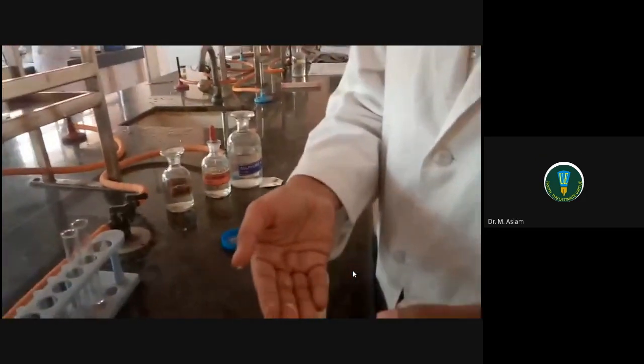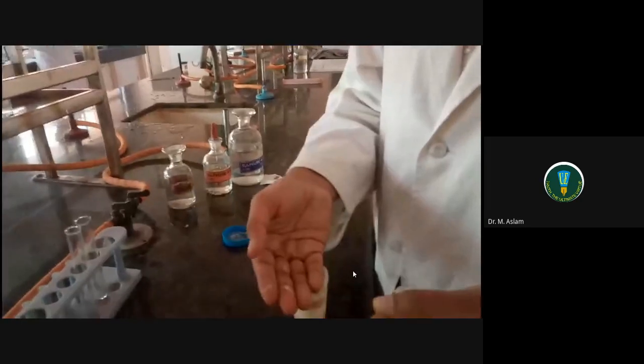So we ignore carbonate. It would never be a carbonate salt. We begin with this anion analysis. You will take the salt in a test tube. To it, you need to add dilute sulfuric acid. That's the first step of anions. Let's put dilute sulfuric acid to it.